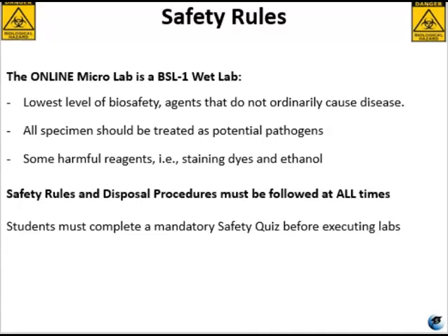Also, some of the reagents are harmful, such as the staining dyes that you're going to be using. These are classified as potential carcinogens. Carcinogen, of course, being a cancer-causing agent. So you're going to want to be very careful with those.